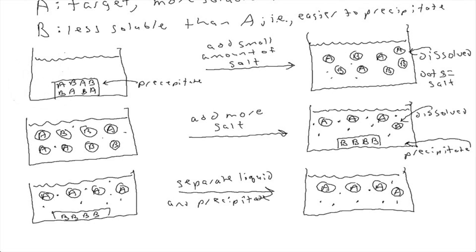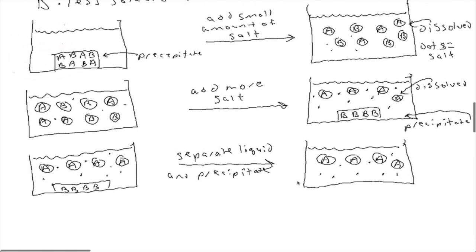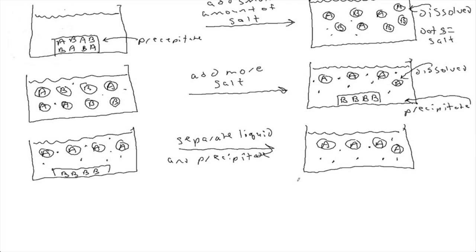Okay, good. So here we have this result. Now, by the way, sometimes I think you might use centrifugation to make sure that the precipitate separates from the liquid as a separate pellet to make it easier to separate them. I don't know if your instructor would go into that on the test. I don't know if that's always necessary. The precipitate might just form on its own.